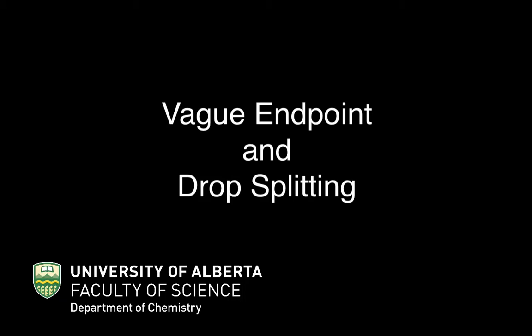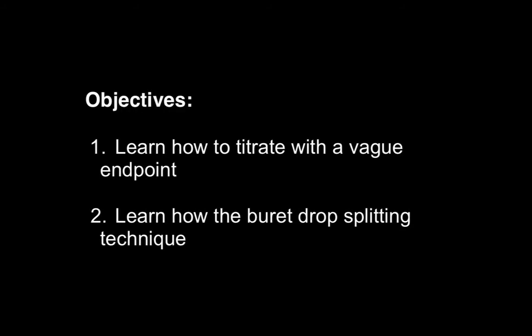Vague Endpoint and Drop Splitting. The objectives of this video are to learn how to titrate a vague endpoint and to learn the burette drop splitting technique.